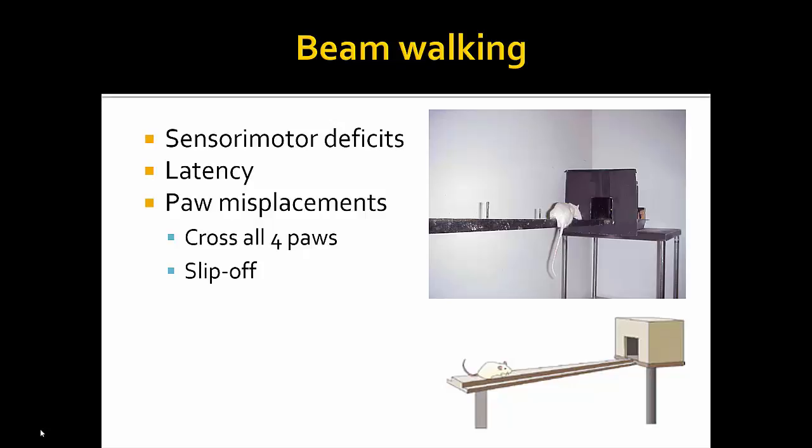We noticed that, so we have depth of how traumatic the brain injury that we do is, and we noticed at like 2.5 millimeters in that they weren't doing this test. But the first day they didn't do it, but the second day, or the third day, or the fourth day.